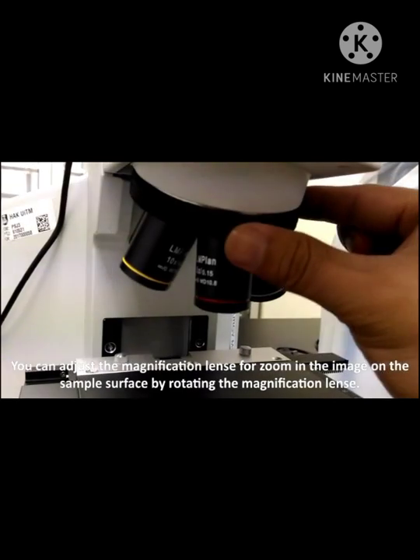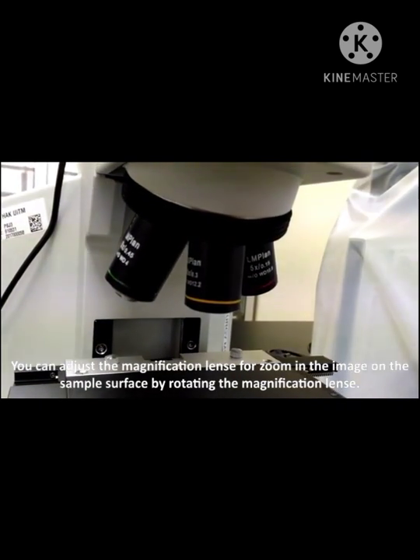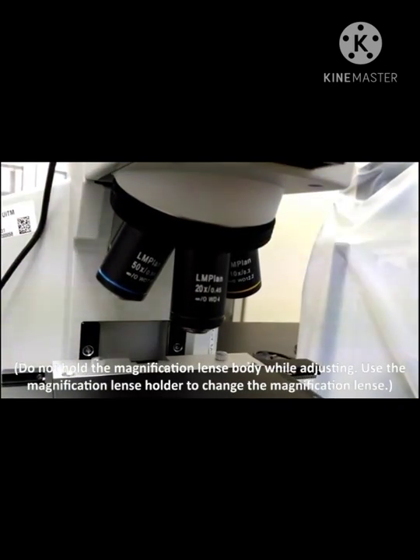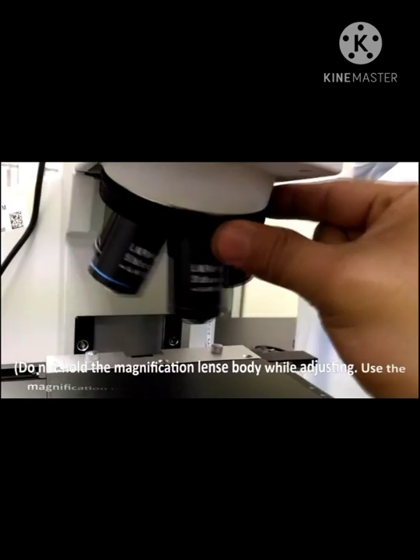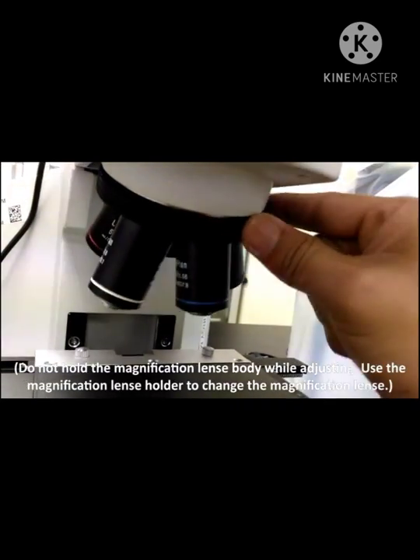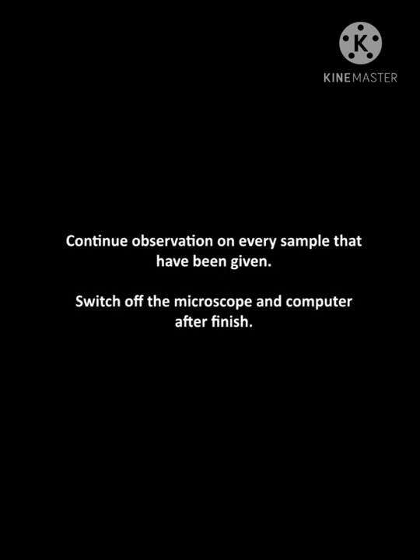You can adjust the magnification lens to zoom in the image on the sample surface by rotating the magnification lens. Continue observation on every sample that you have been given, and switch off the microscope and computer after finish.